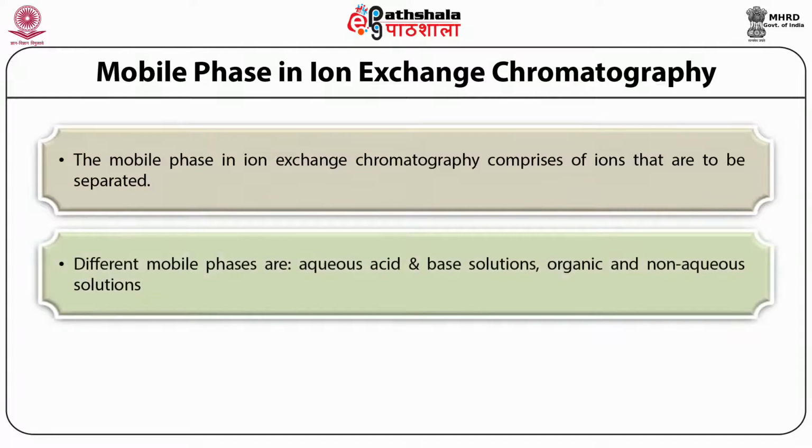Therefore, the different mobile phases can be either aqueous acid and base solutions, that is, buffers, or organic and non-aqueous solutions, depending on the mixture of compounds that are to be separated. It is imperative to make a suitable choice of mobile phase depending on the type of compound that is to be eluted from the mixture of compounds.